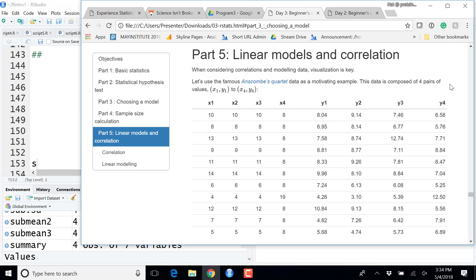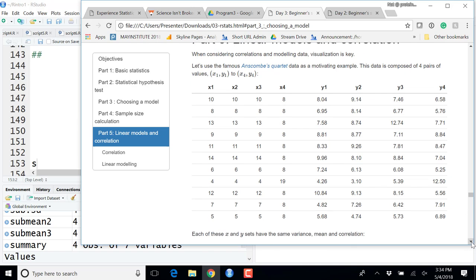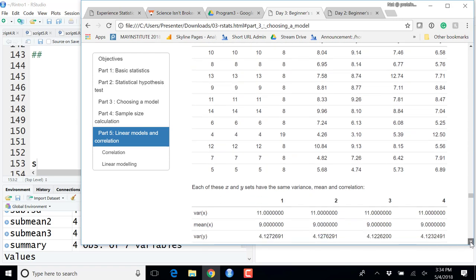So this is our summary file in the Dropbox. I want to show one example. It's a very famous example, as a motivation. This data set has 4 combinations. Here's x1 and y1 paired, and then another combination x2 and y2, and another x3, y3, x4, y4, and then we have 11 measurements for each combination. Based on this, we calculate the very basic summaries that we commonly do.